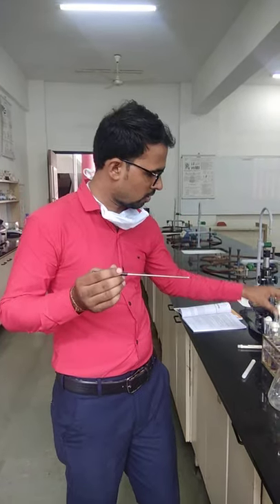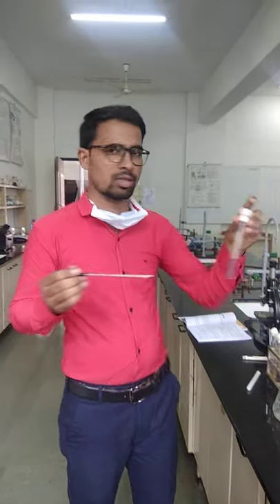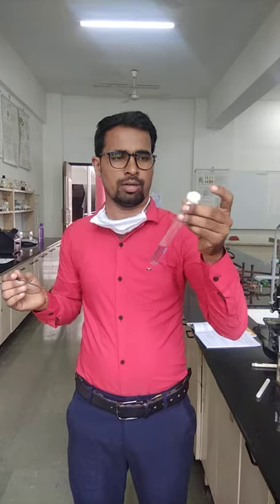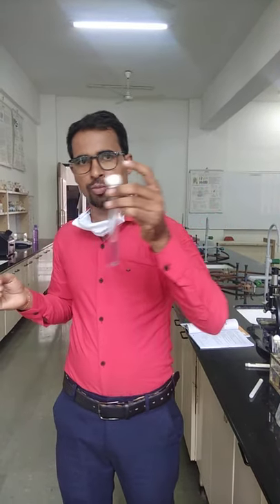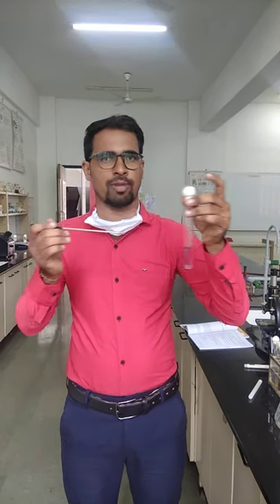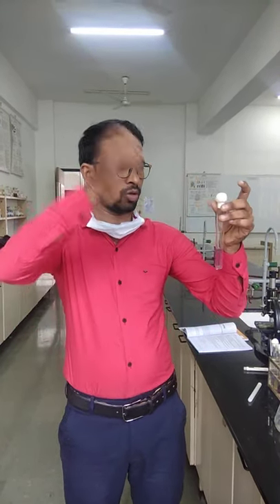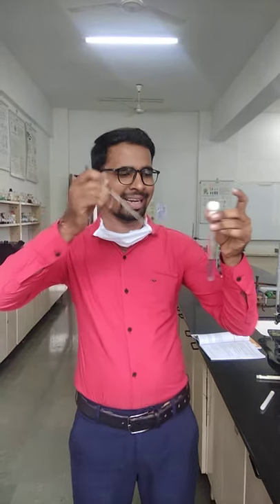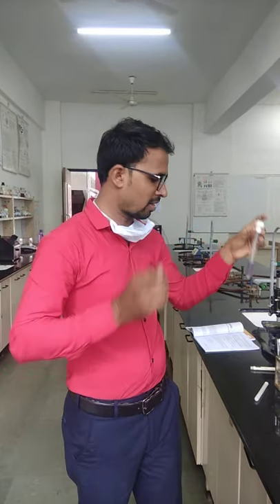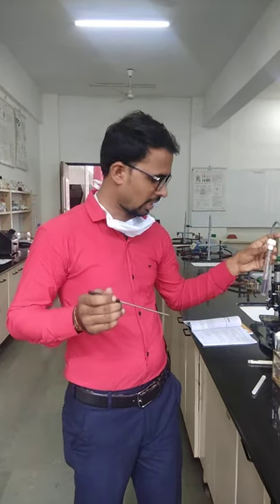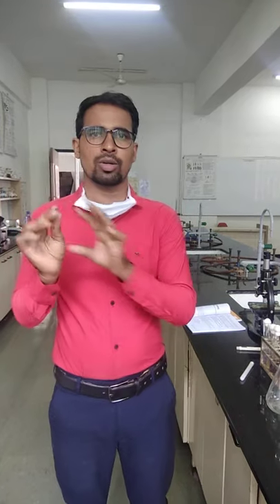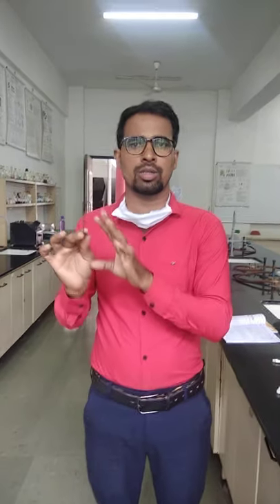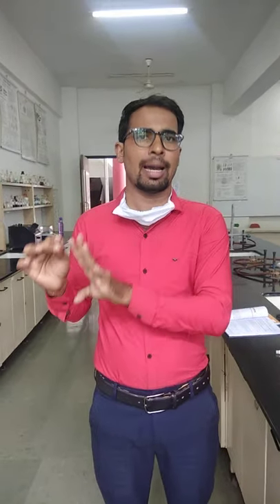Like from this particular test tube, we are going to transfer whatever microbial flora is there into another location. So this is how we are going to use this particular apparatus.